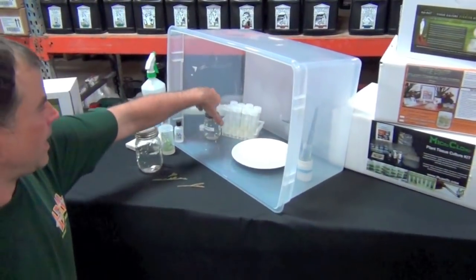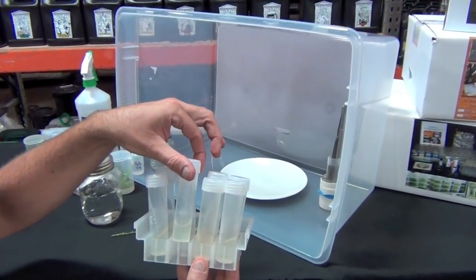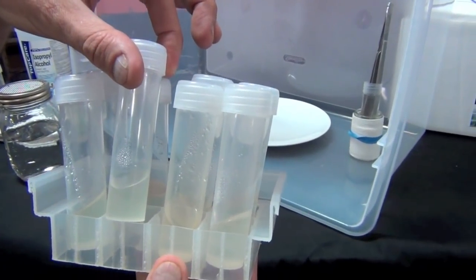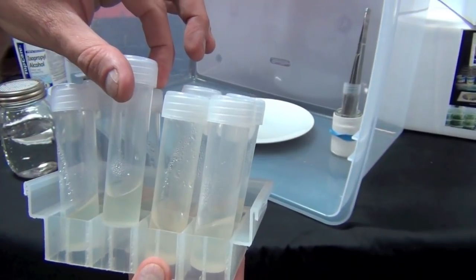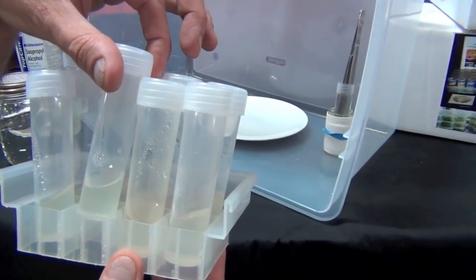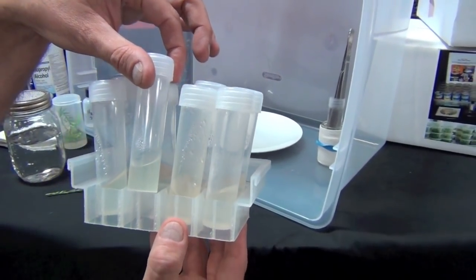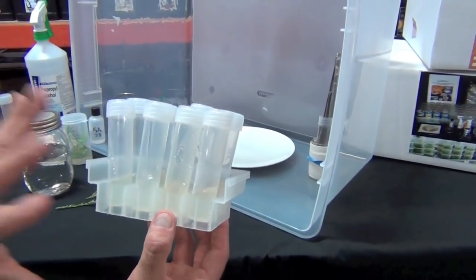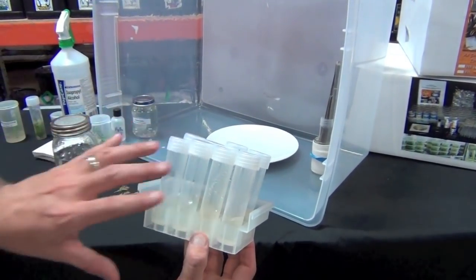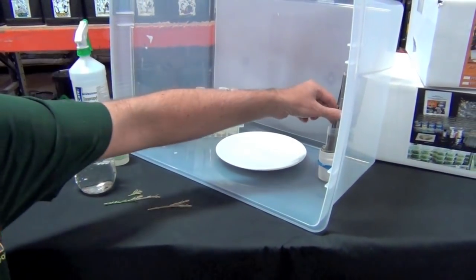The kit, as it's boxed, contains eight prepared tubes that already have the gel in them. This is the gel that contains sugar, hydroponic nutrients, the branching hormone, the preservative, and the agar gel to hold it together. Now it sounds like a lot, but when you buy the kits, these things are all measured and prepared and it's easy to mix them together. We've done the work for you, so these are ready to go. Also in the kit are the tools — a scalpel and forceps — which we'll use to handle the plant after we have cleaned the surface with peroxide water.